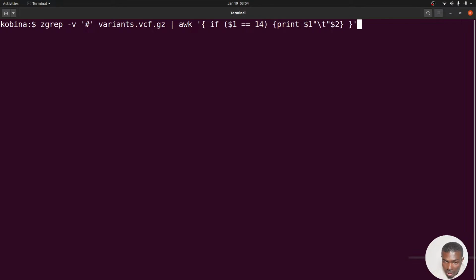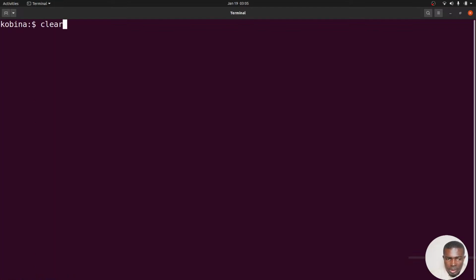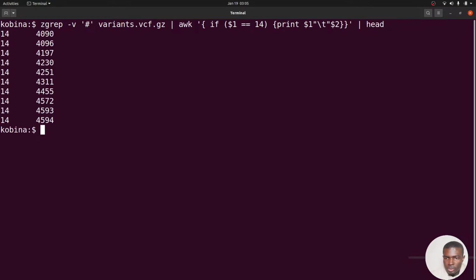Let's just check to make sure that everything is in order. Okay, I think everything is in order now. You don't even need to bring this space. This should work. Let's try this. So let's execute this command. Okay, so this will give us only the chromosome 14. Let's just confirm here. Let's use a head command first to get it. So you will get information for only chromosome 14.